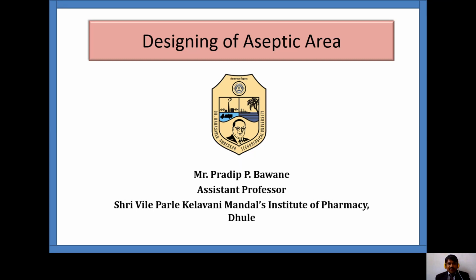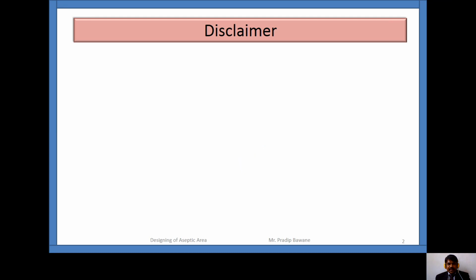Today we are going to discuss the designing of aseptic area.